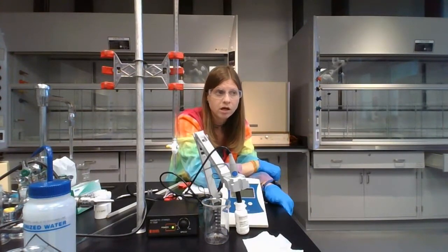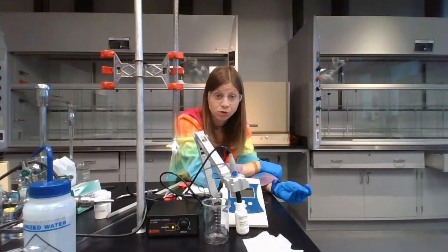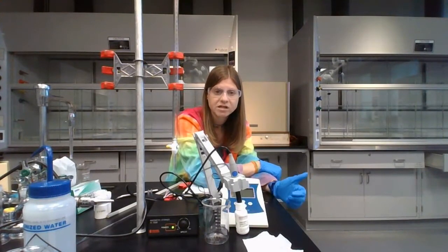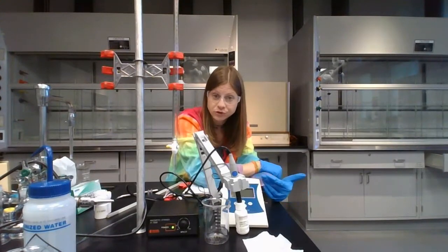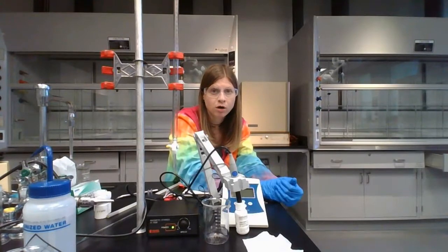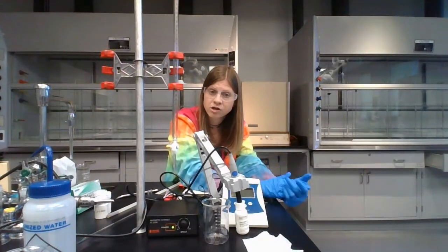So in trial 1, your equivalence point is between two numbers, right? Like in my pretend world, it was between 21 milliliters and 22 milliliters. So I would say that my equivalence point was at 22. It's at the end number. So for trial 2, you're going to have numbers closer together. Like maybe 21.30 and 21.40 were my biggest jumps. So then my equivalence point would be 21.40.